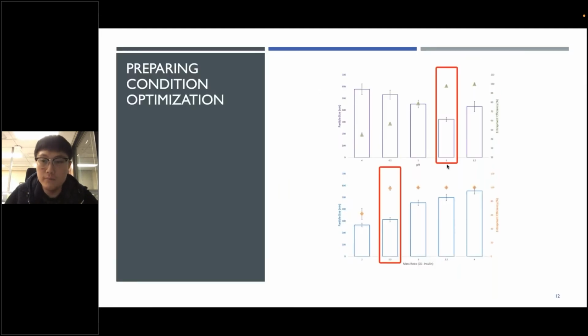And also before the dehydration process, we need to optimize our insulin nanoparticle. As I mentioned, I will use the ionotropic gelation method. So the pH and the mass ratio between chitosan and insulin will affect the final particle size and the entrapment efficiency a lot.